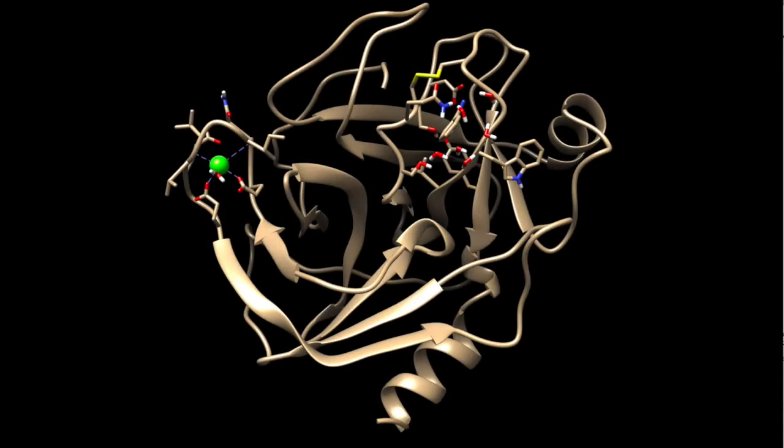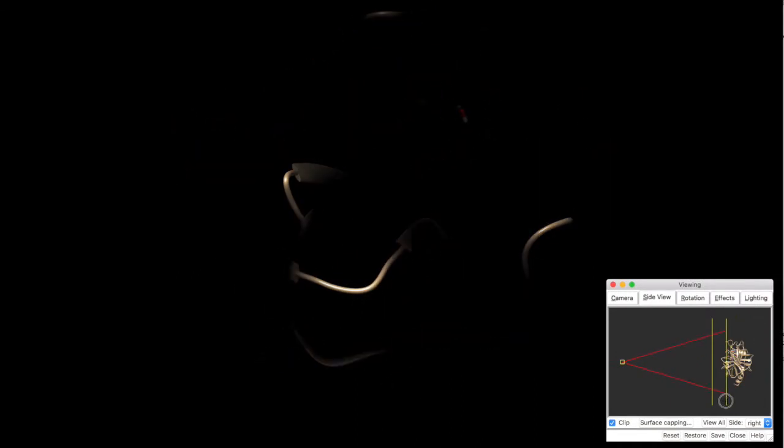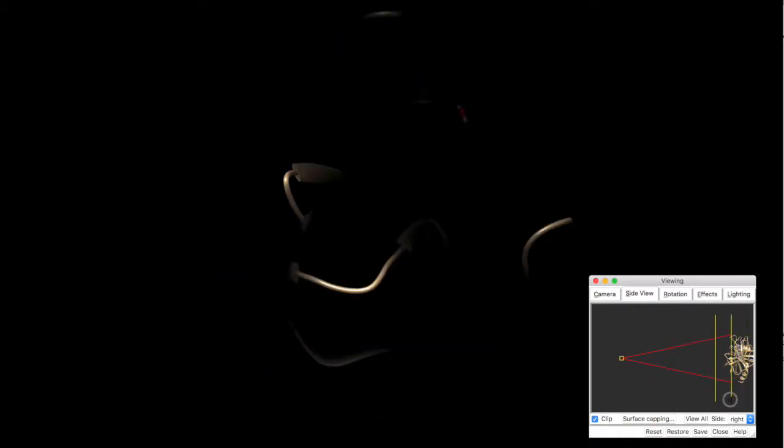Let's say, so what I'm doing here right now, I'm just moving the scenes. So I would like my molecule to have dramatic intro. Okay, that's something like that. So this will be my beginning.